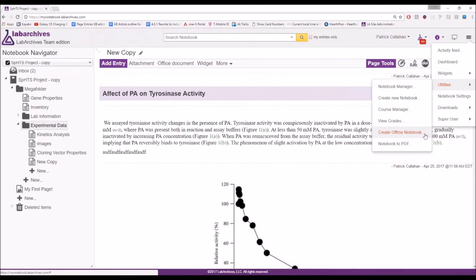Well, these are certainly readable. They're not editable. There's no way to edit your offline copy such that the edits appear online. So if you are interested in doing something like that, I suggest you check out Folder Monitor, which can allow you to edit offline and the edits appear online.